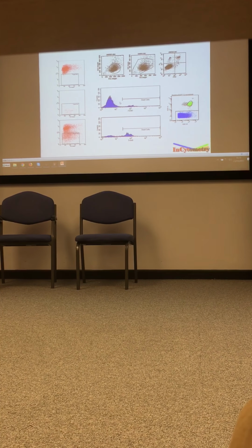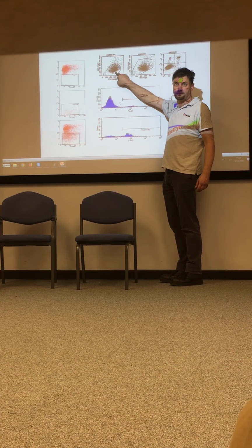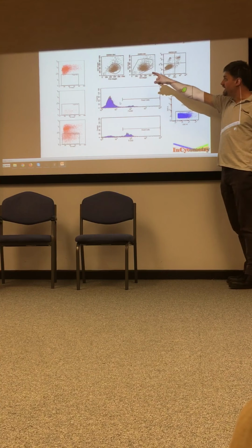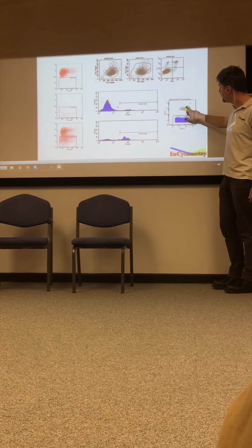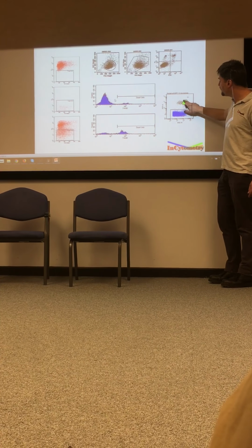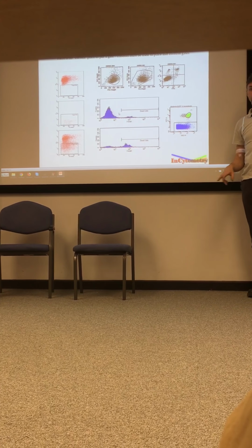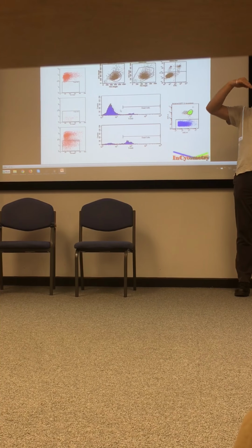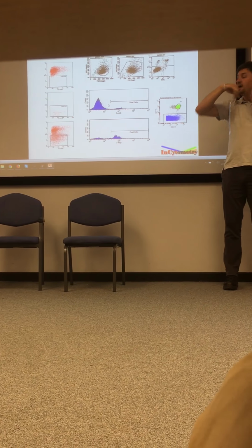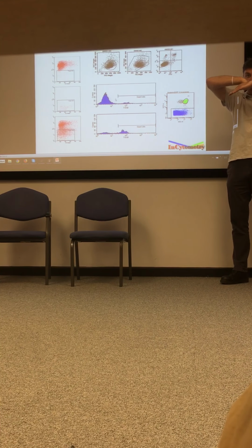Then you've got ones like this. What you've got to remember with gating is, how tight do you want it to be? Well, it depends what you're analysing. That is relatively easy. This one, less so. If we're putting a gate here, we've got that side population. If I did a gate like that, then I'm going to have more of my cells of interest. Because what you've got to remember is that, because the populations are next to each other, it's not at this point they stop being this cell type and become that cell type. They don't. They're like that.